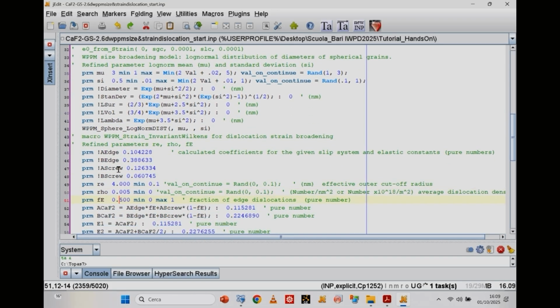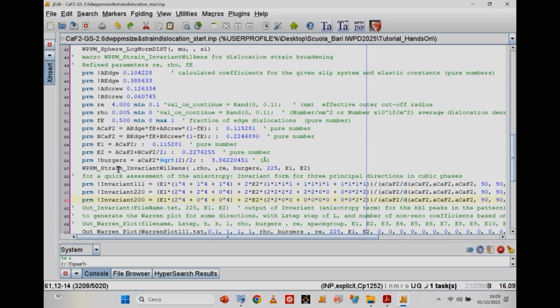Then here, calculation assuming dislocation. Here I have to explain something. If you want to use dislocations and have a realistic number for the density, you need to know this contrast factor. Who gives you the contrast factor? Well, at the moment, there is no software for doing that. I have a Mathematica script doing this, and that usually doesn't crash.